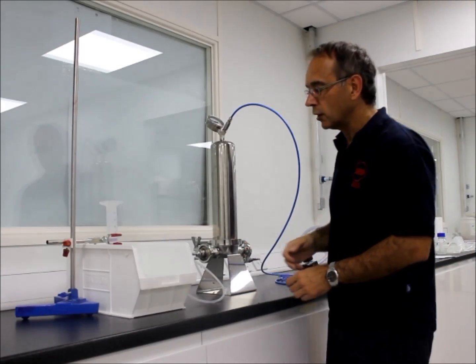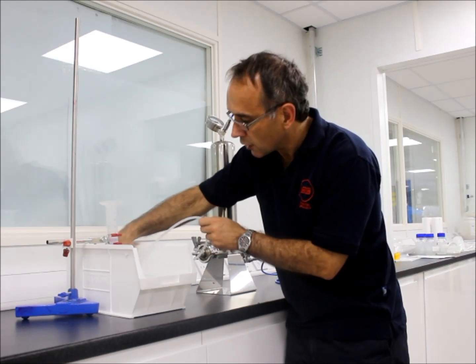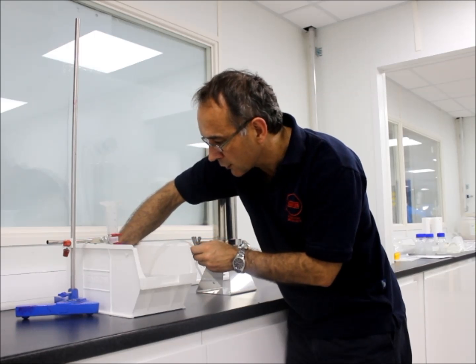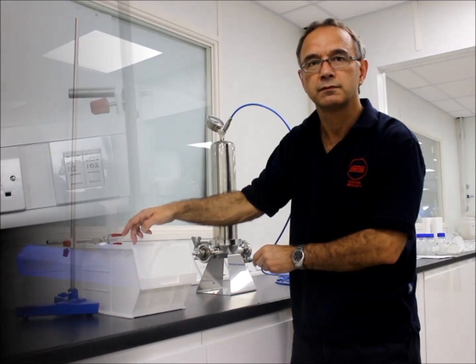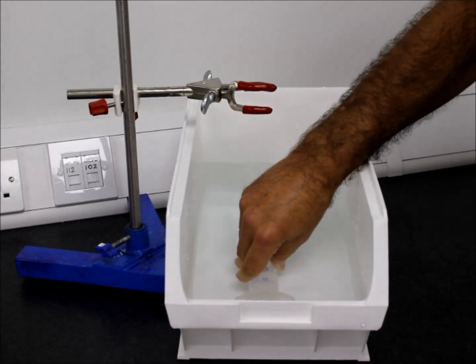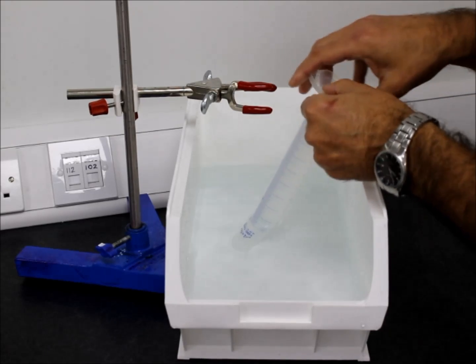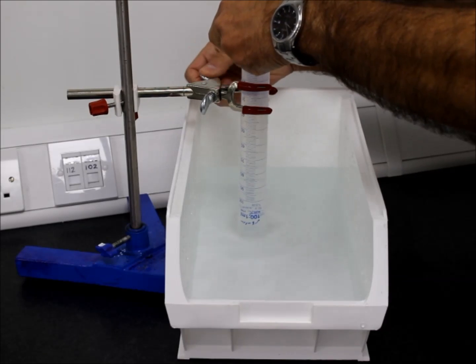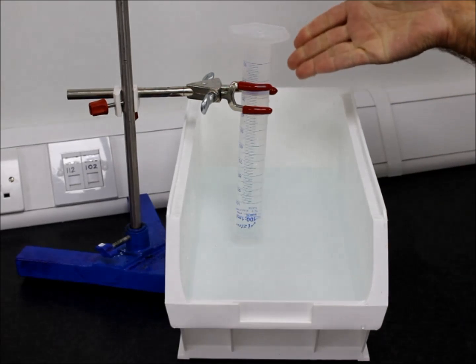Once we have 2.41 bar, we can take this tube and insert it into this inverted measuring cylinder which is full of water. Air will flow into that, it will displace the water, and we can measure the flow. To fill the measuring cylinder, you simply submerge it under water until it is full, then invert the measuring cylinder whilst keeping the end under the water, and then simply clamp it into the system. And there you have your measuring cylinder full of water ready to do the measurement.